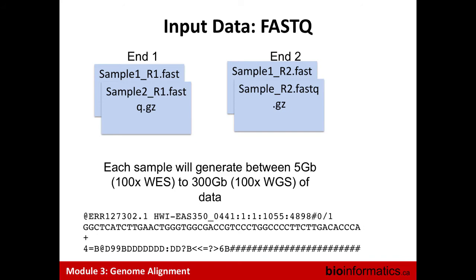You have a third line that can be used to add a copy of the header, but the beginning is different. Why do we have this third line? Because at the beginning, the first sequencers were separating the sequence and the quality lines, so they needed to have 2 headers. When people decided to merge all of it into one format, they kept the two headers, and some technologies still give a second header, but Illumina will never give you a second header. They will just give you a plus sign on the third line.